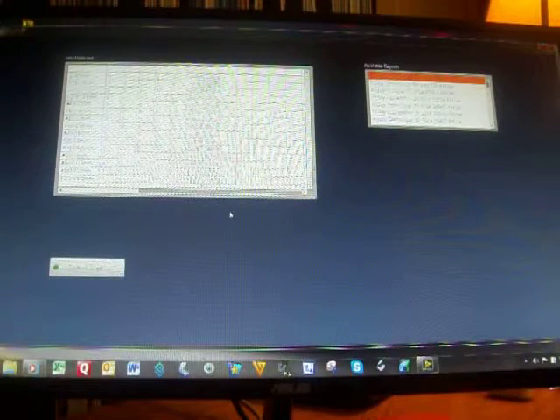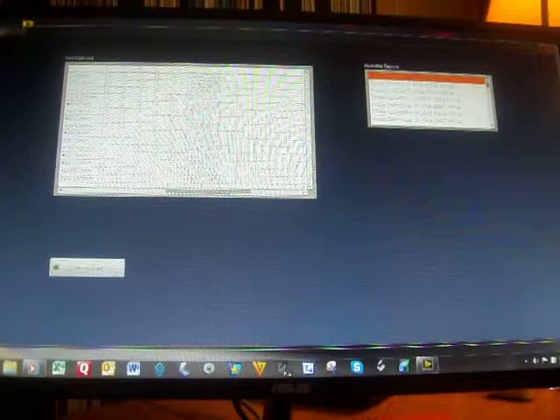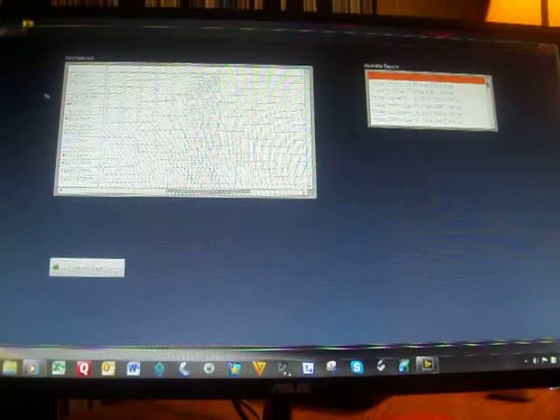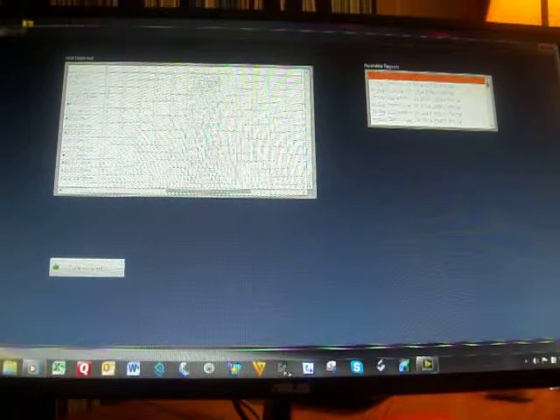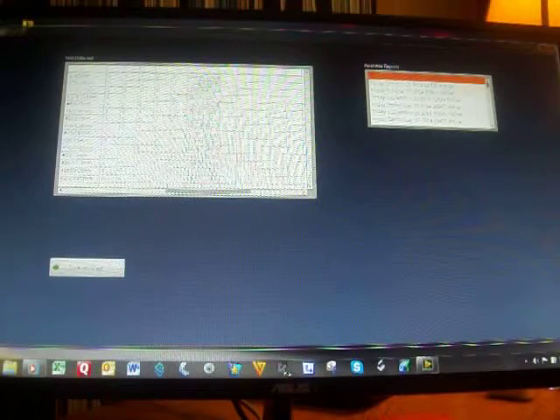And if we zoom over here, we can see the actual weight of what was left in each one of the sieves. I suppose we could run another test and only select a couple of sieves, and you'd see that it would add up to the next selected one below it if it was not selected itself. Over here is a display of all available tests that we could look at from the past.